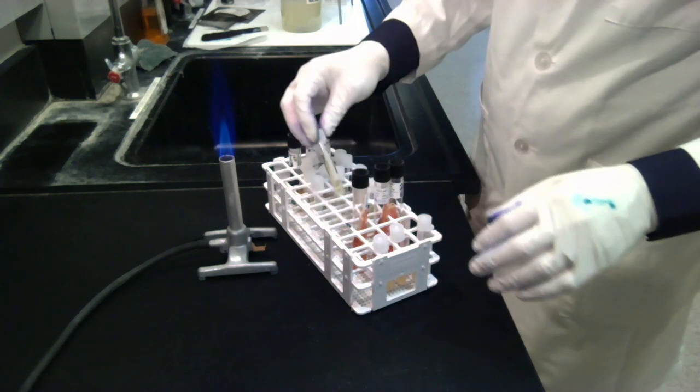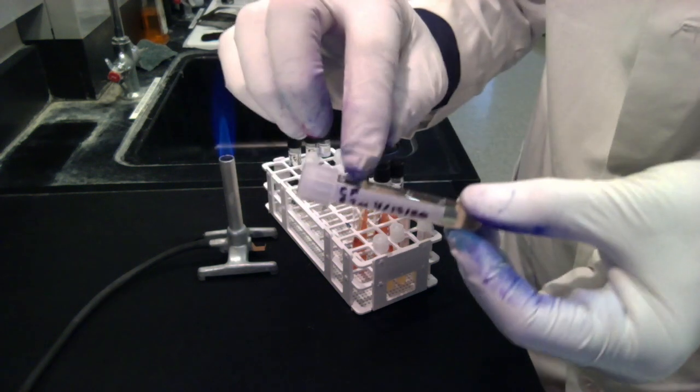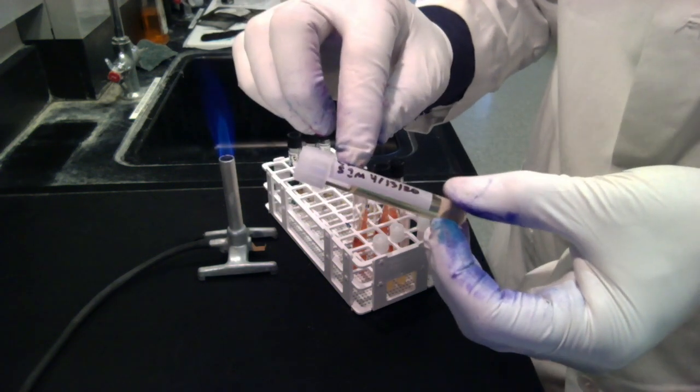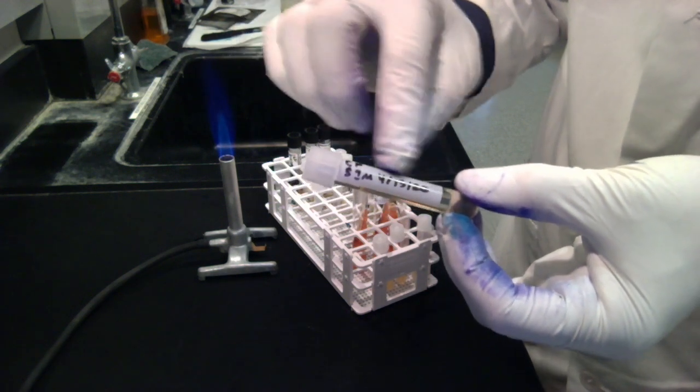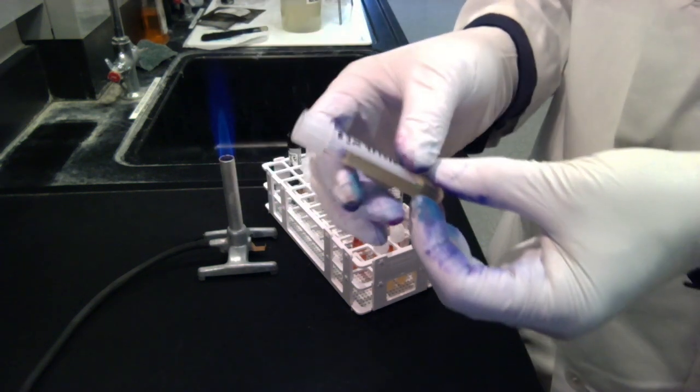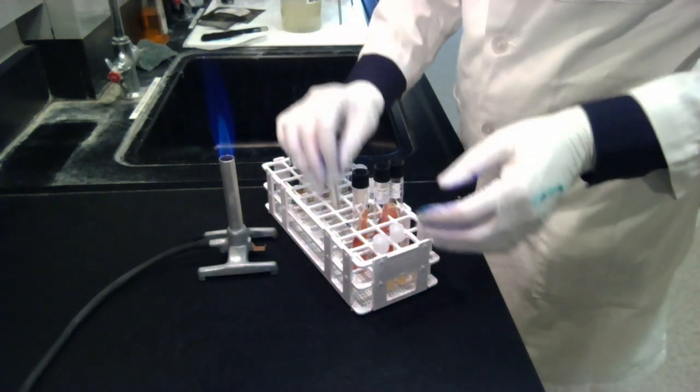The next thing you want to do is always label your tubes. So, on this tube here, I have CF for C for undii, I have SIM, that's the test, and then the date. You also want to write on here your initials, so that you know that it belongs to you.